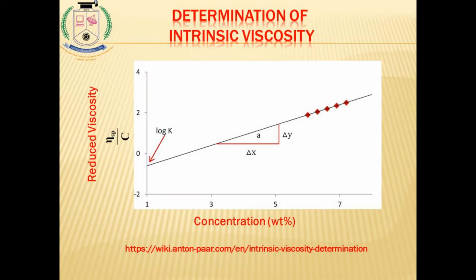Yes, this is one of the important slides to discuss. This is the graph explaining the relation between reduced viscosity and concentration.